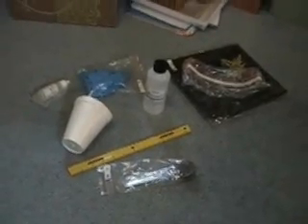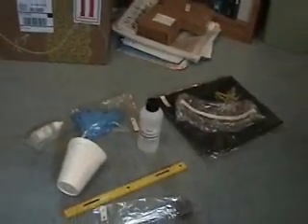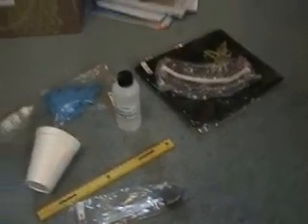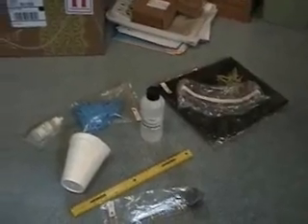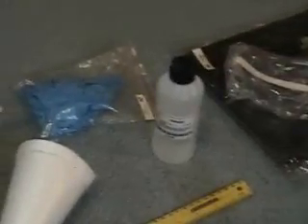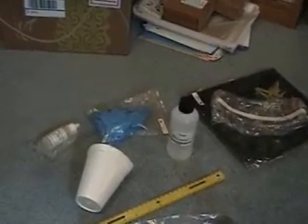Okay, there is basically your material box. That's my material box that I got everything in. What I went ahead and did is I pulled out the material that I'm going to need, and I'm going to read them off here. As we have, you're going to need your goggles, apron, the disposable gloves, which you should get. I have 2 bags with several in. The vinegar, you're going to need a cup. You're also going to need the sodium hydroxide, which is in a little vial right there.